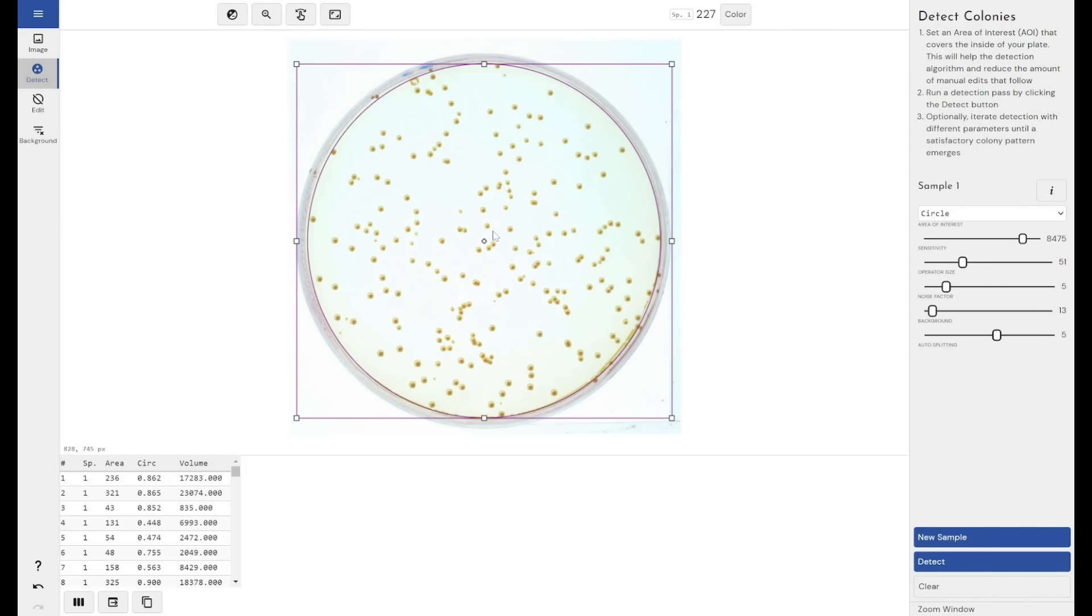By default, it's done a really good job on this image. It's telling me that there are 227 colonies within this area of interest that I've detected.